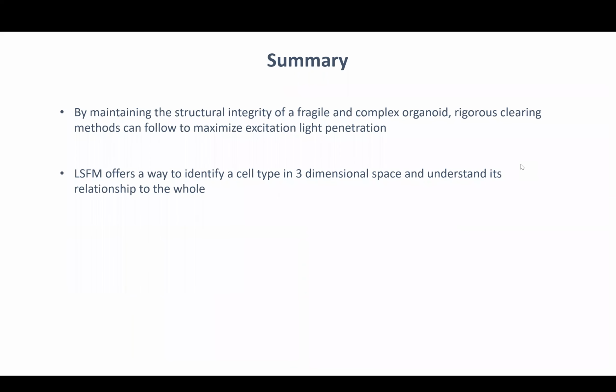So in summary, by maintaining the structural integrity of a fragile and complex organoid, rigorous clearing methods can follow to maximize excitation light penetration. And also light sheet fluorescence microscopy offers a way to identify a cell type in 3-dimensional space and understand its relationship to the whole.